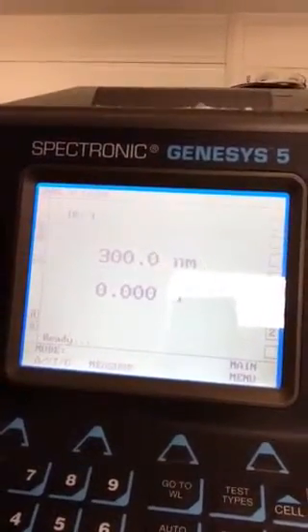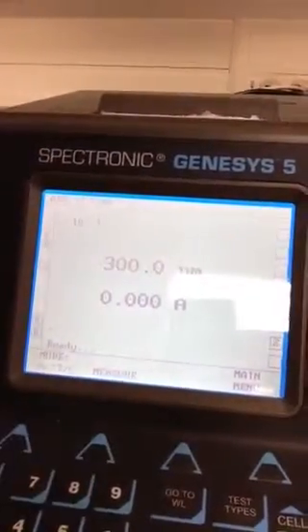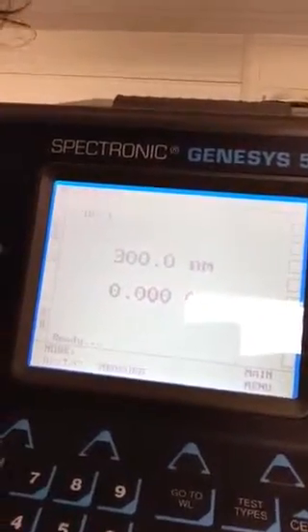And so what you do is you increment that reading and you write down these readings, and then what you'll do is you'll get the list of absorbances that were given to you to process that came from Dr. Hallen's group, and that's what you're going to make your chart out of.